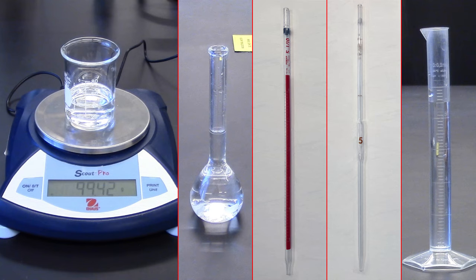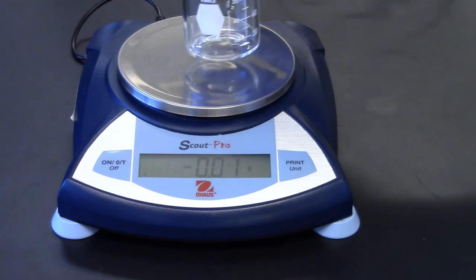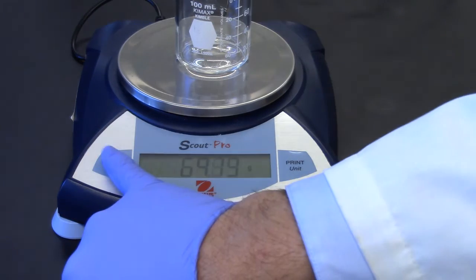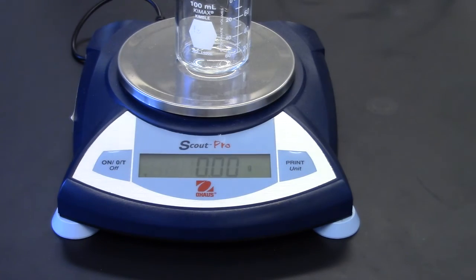There are other measuring devices that may be available. An electron balance has the tare function that lets you tell the balance that your empty, dry beaker is zero. The weight of the beaker is automatically deducted from all your measurements.